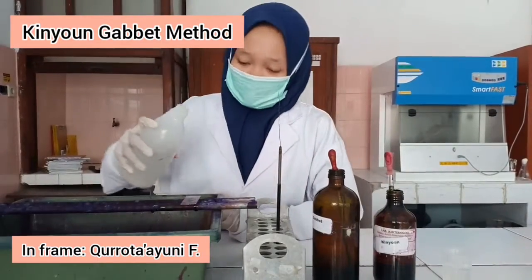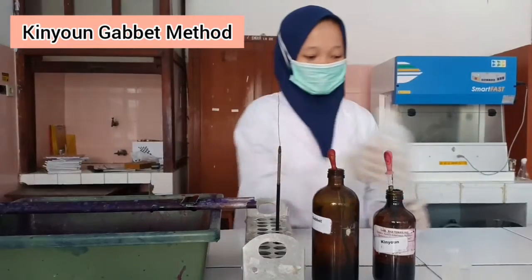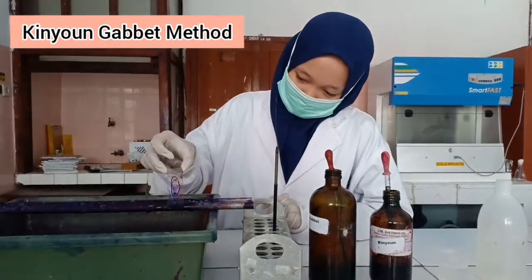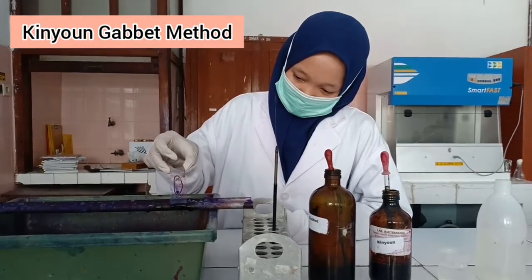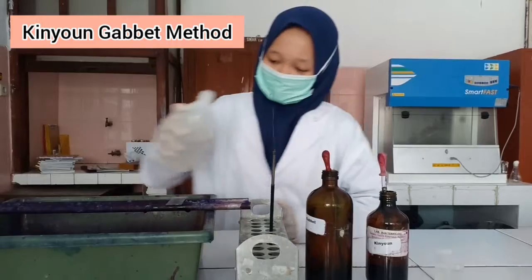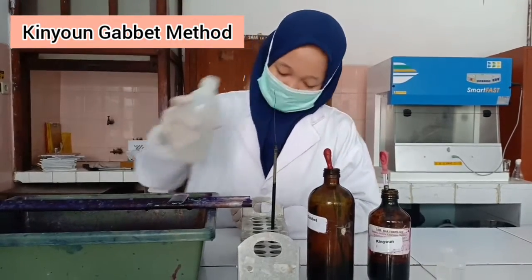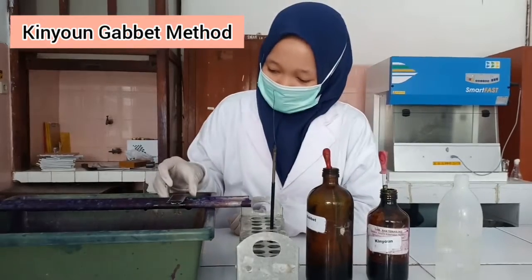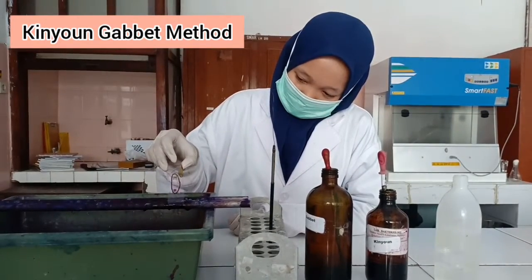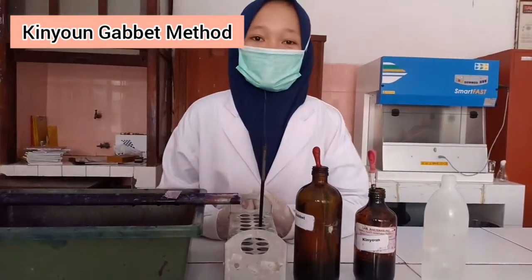Rinse with aquadest again. And the last, let it dry.